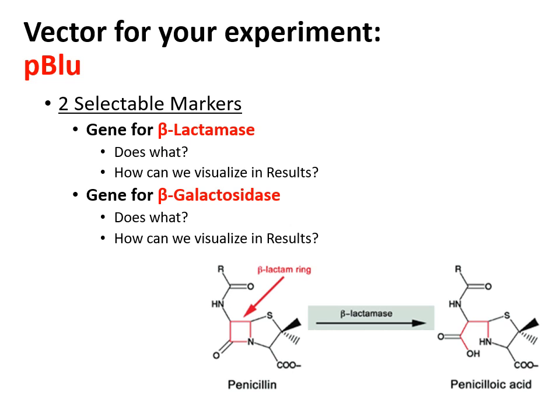Please circle, star, highlight the fact that they will only turn blue if they have pBlue and, circle, star, underline, and if X-gal is present on the plate. So we label those plates as LB, which is the regular nutrients, and we put LB AMP because they have ampicillin in them, and X-gal.